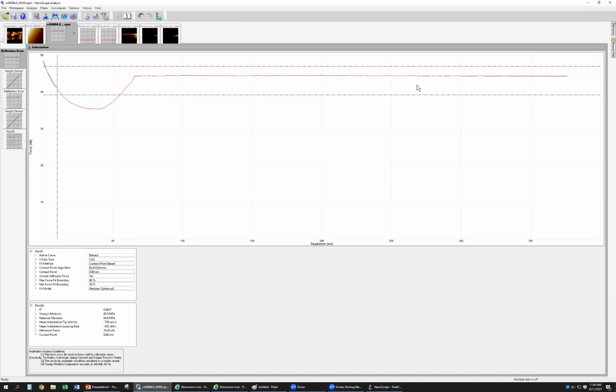This is air, go back to air. Then from here, extend this one to this curve. That means the probe should withdraw from here to here, should have left the surface, right? Because of the adhesion, it cannot go back, but here should be the top one, right? So the depth should be from here to here. From this extended to here, then you can see from here to here is your depth. Okay, this is how to measure indentation depth.